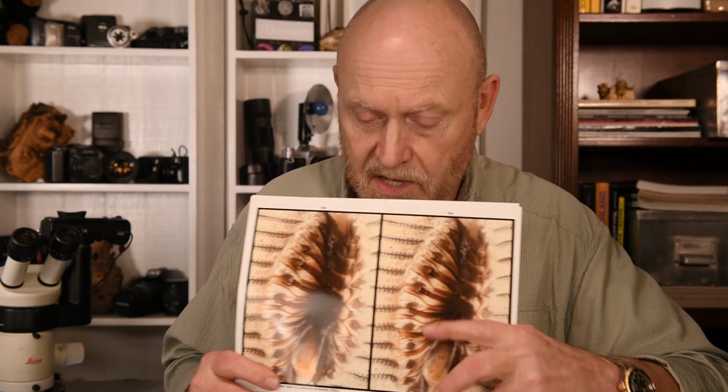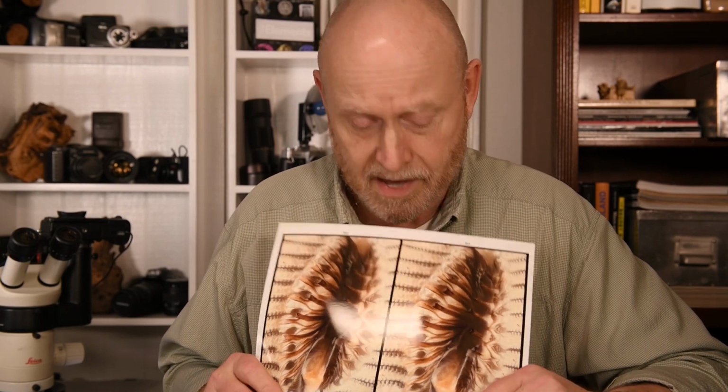This right here, these pictures here, this is the sucky part of a blowfly's tongue. Yeah, we'll call it that for now. It's the pseudotrachea here on the edges, and then these things are capillary tubes. It doesn't look like much there. But when you put on these glasses and you look at this, those brown things are coming up at your face. So I had so much fun. I couldn't stop grinning and laughing out loud looking at these things because I just wasn't expecting how much fun it was.